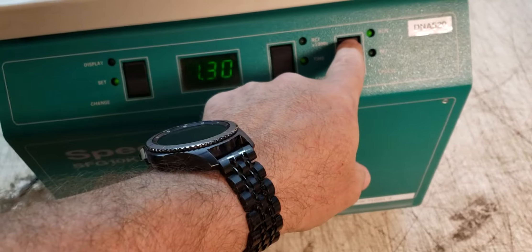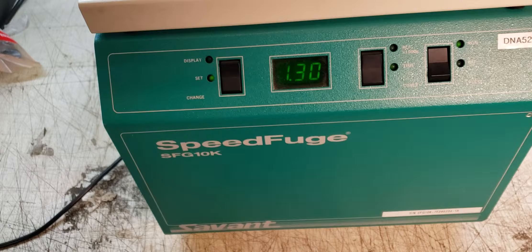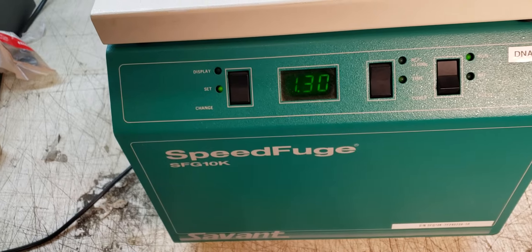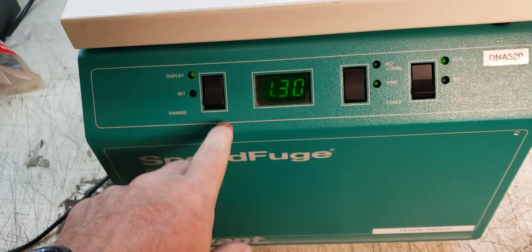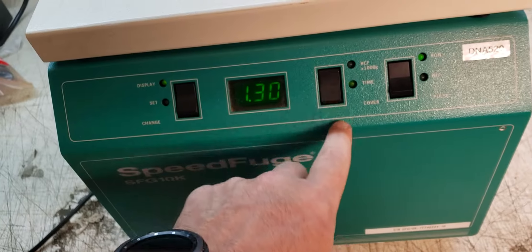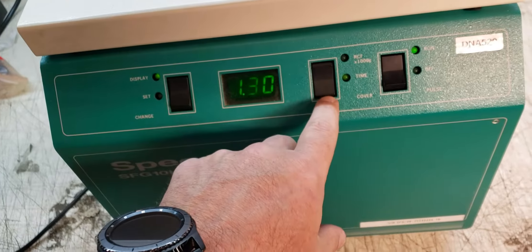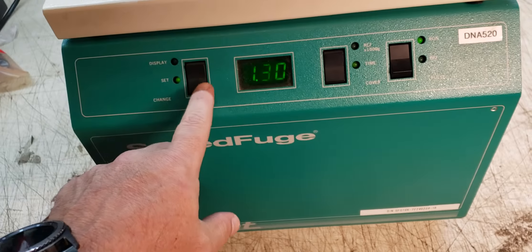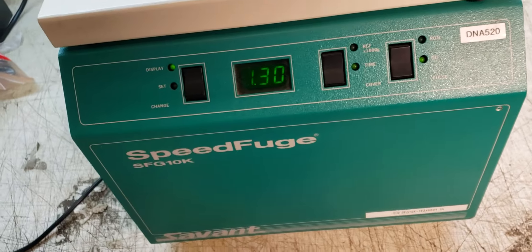I'll show you this thing running. Let's see — display the speed. Maybe it goes up to 10K and that's it.